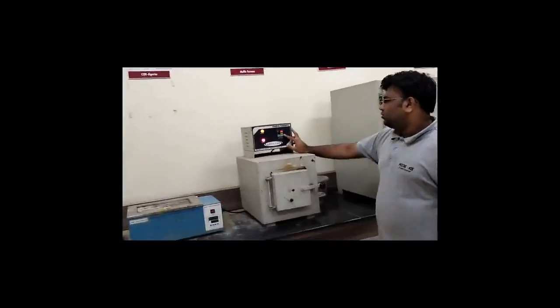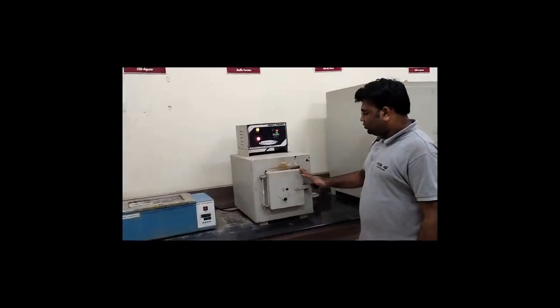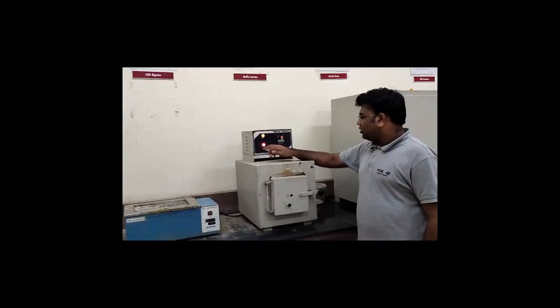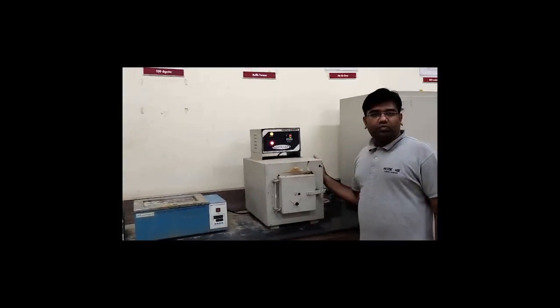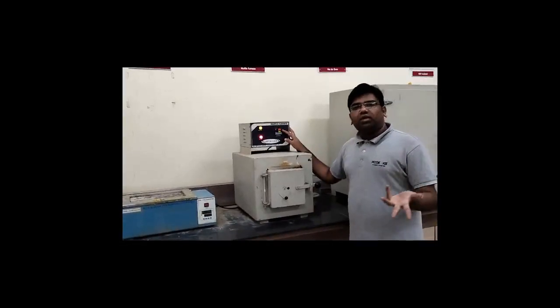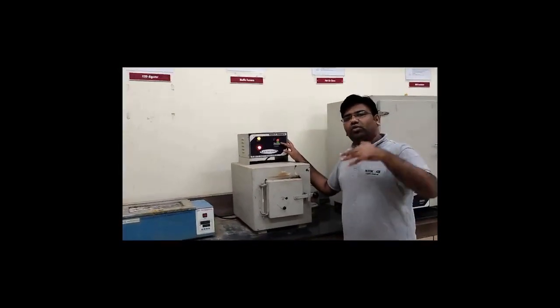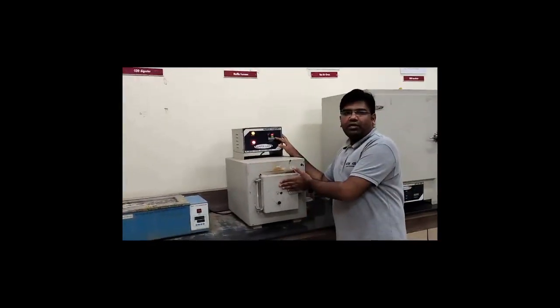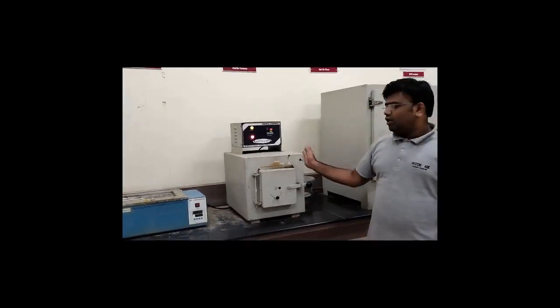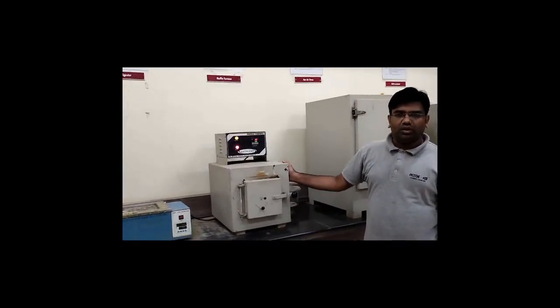Now you can see 550 is the set temperature and 26 is the current temperature. So it is heating. The yellow light indicates that it is heating. To achieve 550 degrees Celsius, it will require about half an hour. And after it reaches 550, we are going to keep these crucibles here for the next 30 minutes. So the total duration is approximately 1 hour. After 1 hour, we are going to remove these crucibles for the further calculation of the volatile solids.